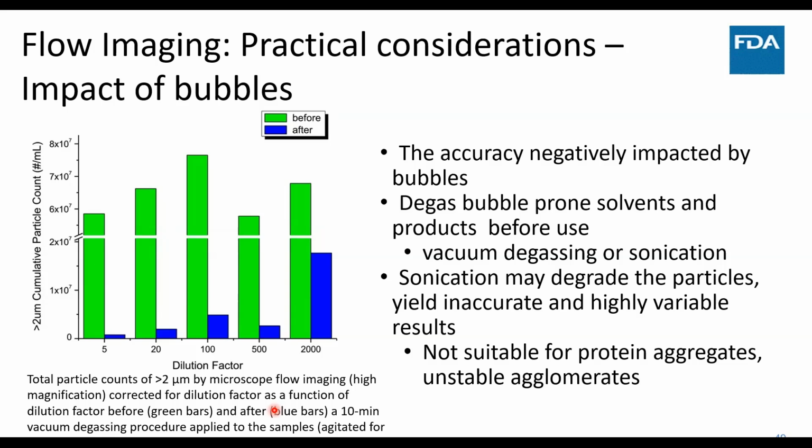Use vacuum degas, not sonication. What I would say is avoid sonication at all costs if possible. If a company is using sonication, you want to see data ensuring that sonication is not degrading your particles over time. It's not suitable for protein aggregates and unstable agglomerates.